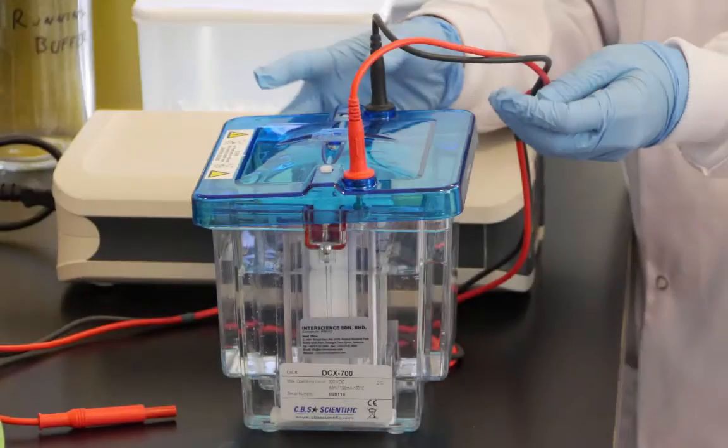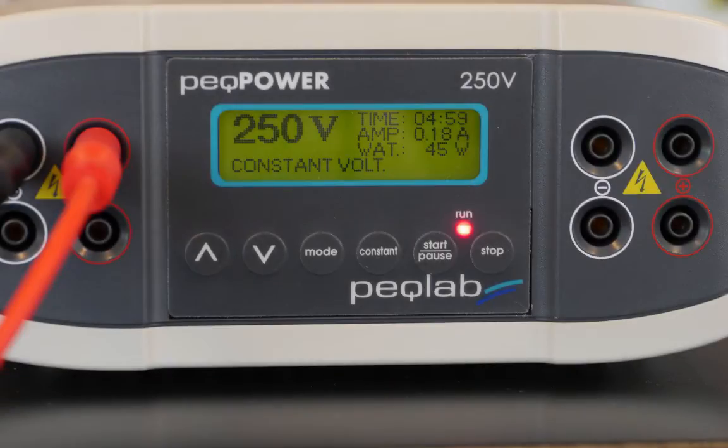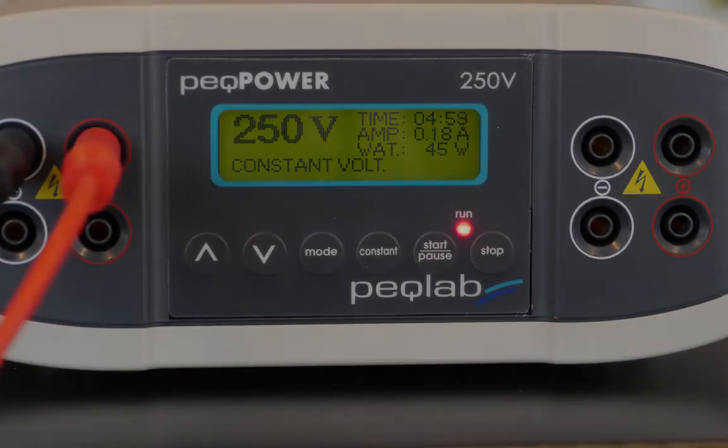The lid was placed on the tank and the gel was run at a constant voltage of 250 volts, 0.1 amp per gel.